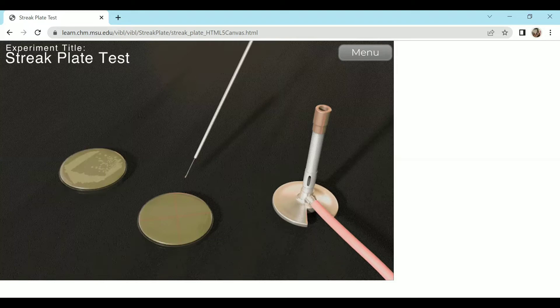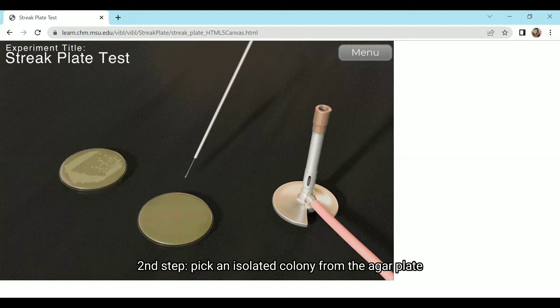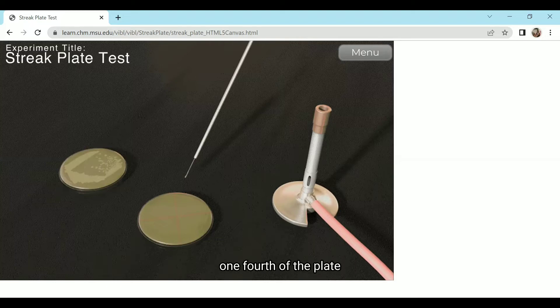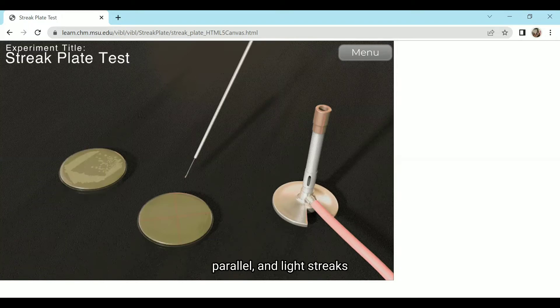Second step, pick an isolated colony from the agar plate and spread it over approximately one-fourth of the plate using close, parallel, and light streaks.